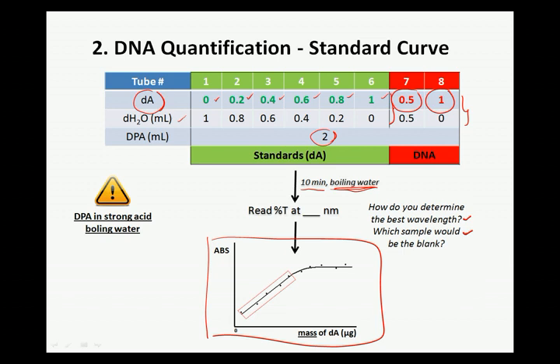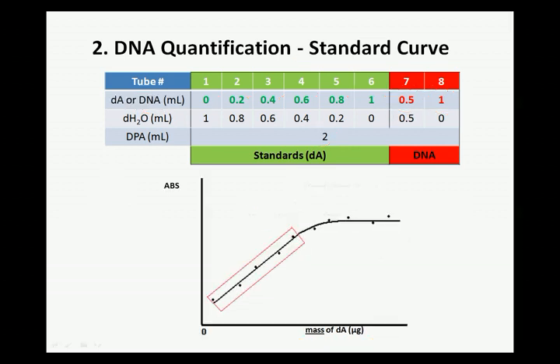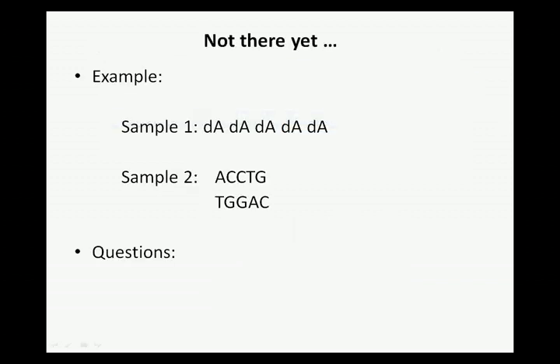Then you can compare these absorbances to the ones you have generated with the standard samples, and therefore the standard curve, and figure out the concentrations. Here it's exactly what we're saying. I just kept it separate to focus, but all of these samples should be done at the same time, all of this reaction, to save time.